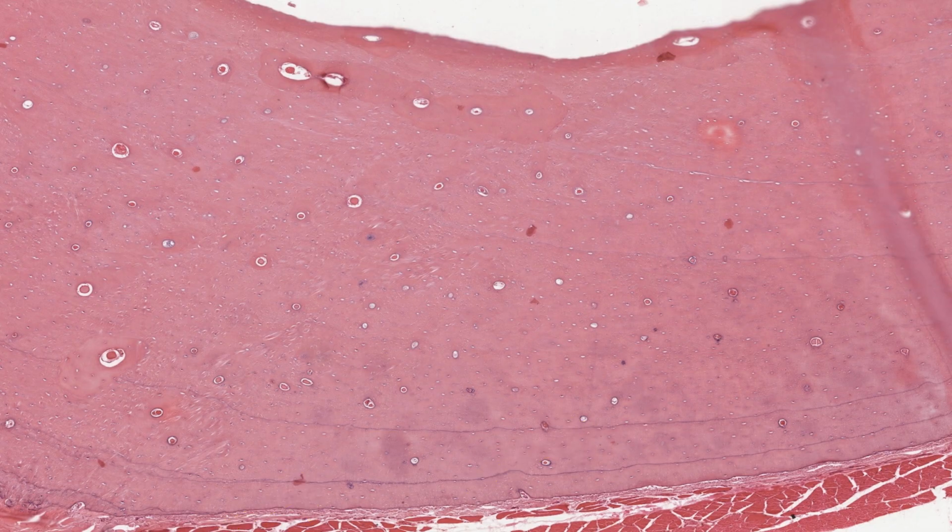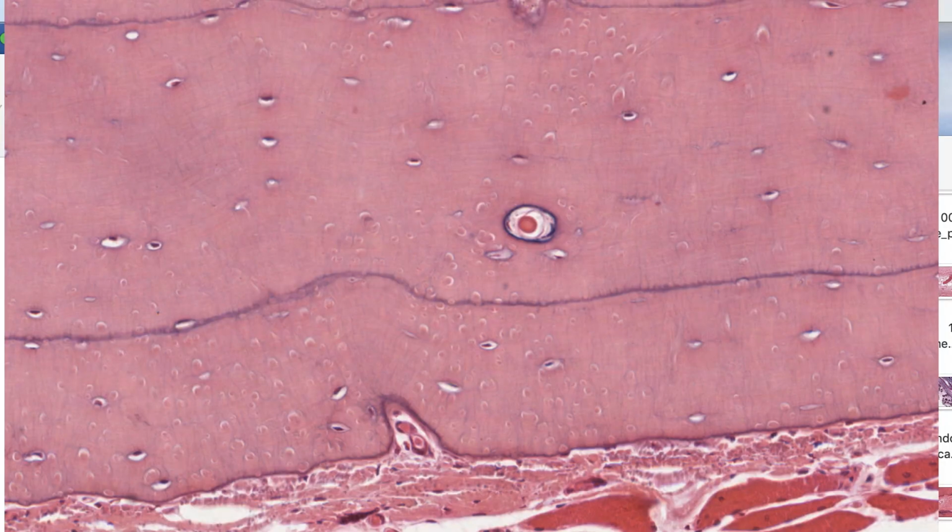These lines represent sites or times during bone deposition at which extra amounts of ground substance were secreted when the bone was being laid down. The larger white spaces in the bone tissue are around blood vessels. These Haversian canals run longitudinally in a long bone such as a femur, so you see them here in transverse section. In the outer part of the bone, the blood vessels lie between circumferential lamellae and were incorporated from the periosteum as new lamellae were deposited.